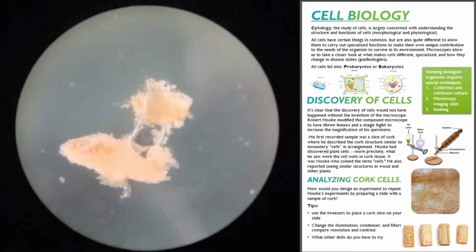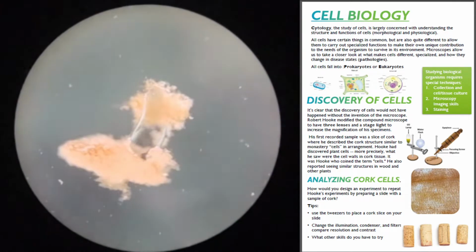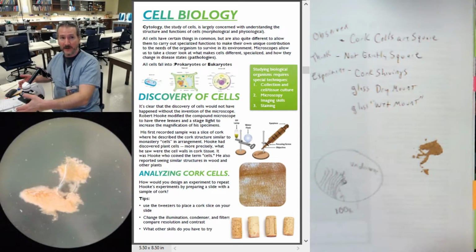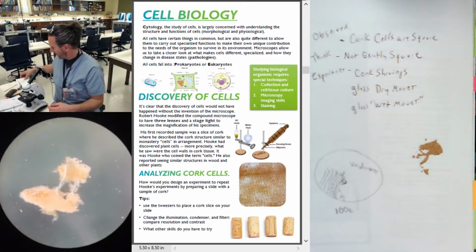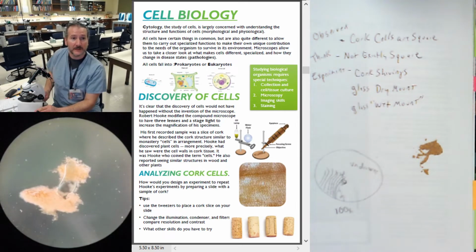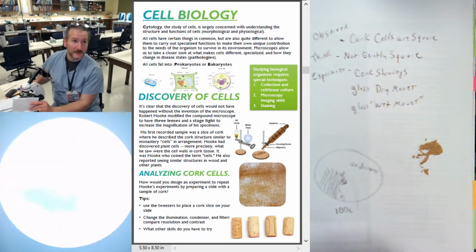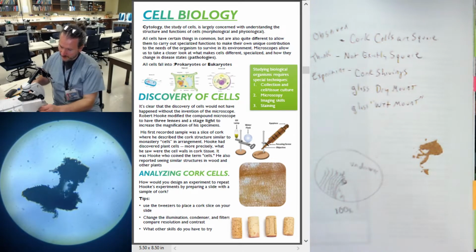Let me see what I can see here. So I'm still looking from the top. I actually have no lights on my microscope right now. We were seeing that really well. So I'm going to have to block some of this light just so I can get some contrast. Oh, here we go. Lens paper book. And I'm going to turn on my bottom lighting, the number 2 on the power. Okay. Blocking it. Whoops. Sorry. There it goes. Scan this up a little bit better.